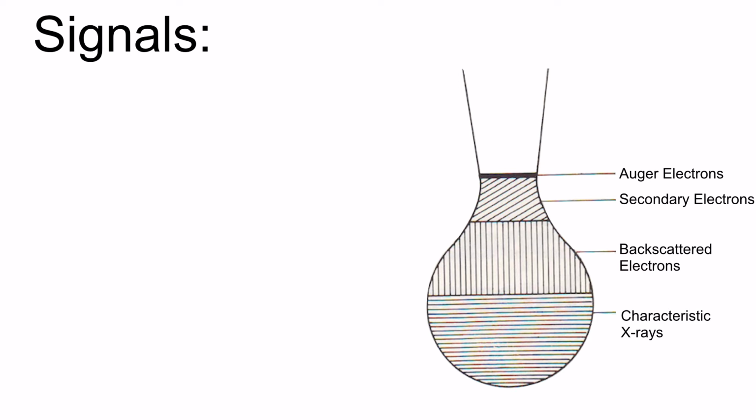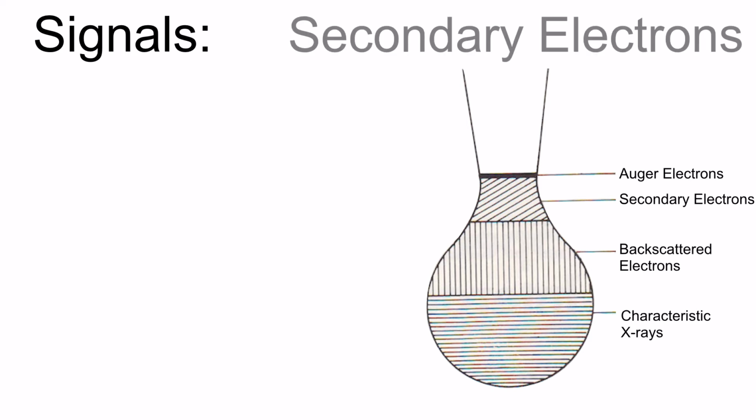The behavior of electrons, after they strike the specimen, is determined by both the elastic collisions and inelastic scattering processes between the incident electron and the atoms of the specimen. Inelastic events arise from electron-electron interactions and are responsible for the liberation of low-energy secondary electrons from the atoms.